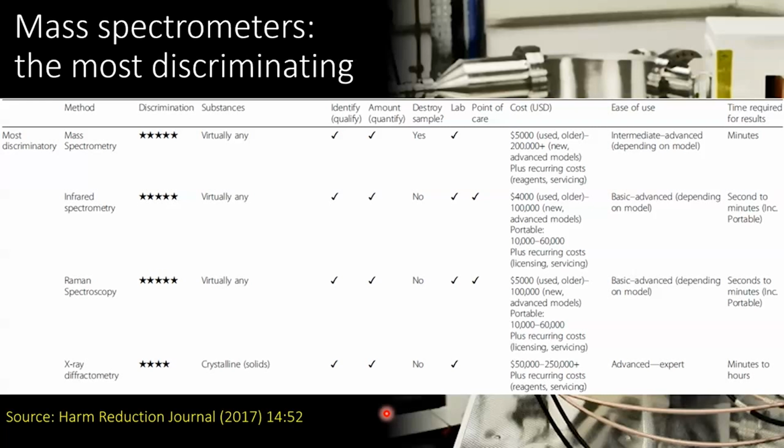And if we look at mass spectrometry, focusing there, we can see that it can identify chemical substances. It's also claimed that it can quantify the amount of the substance, although I would say that more often than not, it'll have some sort of linked instrument to allow it to do that. So very often a mass spectrometer is the end point linked to a gas chromatograph or a liquid chromatograph, and it's those chromatographs that actually quantify the amount of each component of your sample, and then the mass spectrometer's job is to identify unambiguously what the structure of that chemical species is.